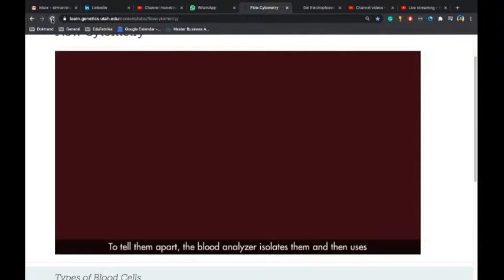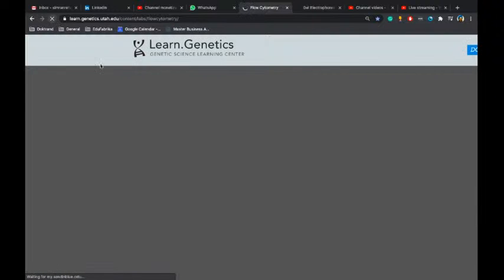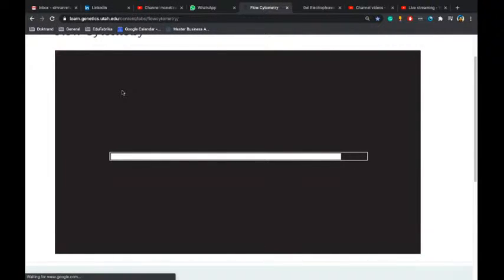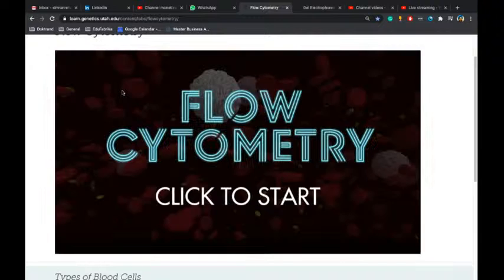Sorry students, some errors with the internet, with a networking issue. Let me go through the last slide then. So you are basically understanding how we are differentiating between B cells and T cells by adding different tags, and then we run under the flow cytometer and we can differentiate between these two cell types.